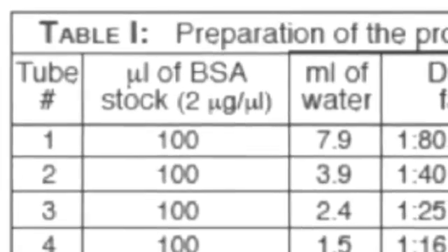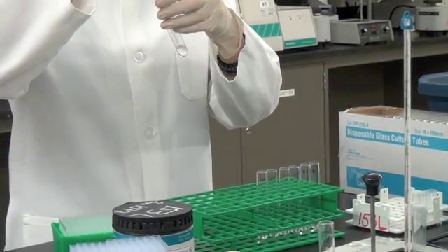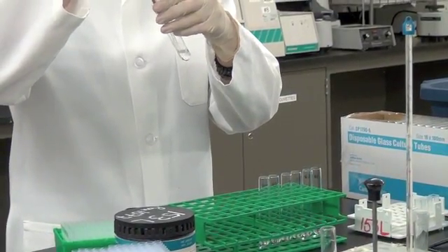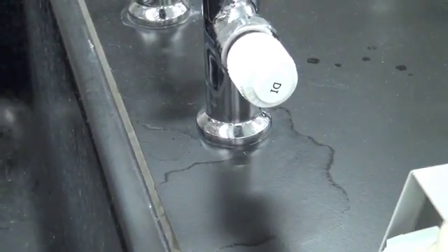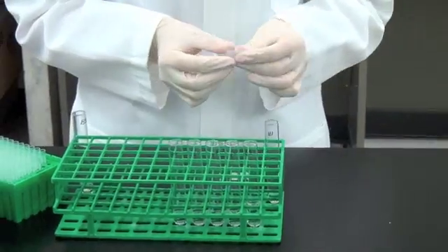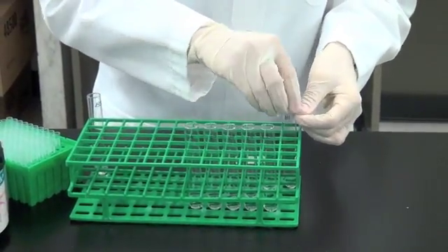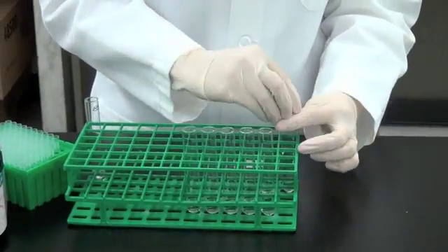In following the lab manual's table for the BSA standards, you will take the prescribed aliquots of the BSA stock solution and add it to deionized water. If the solution has a volume greater than half the capacity of the tube, don't forget to use parafilm to seal the top of the tube and mix by inversion.